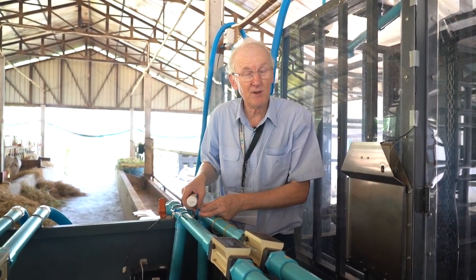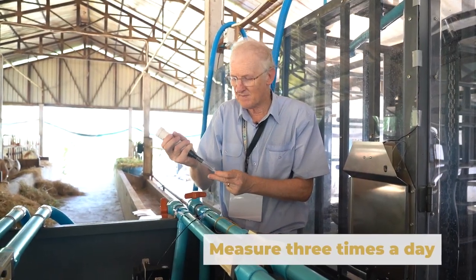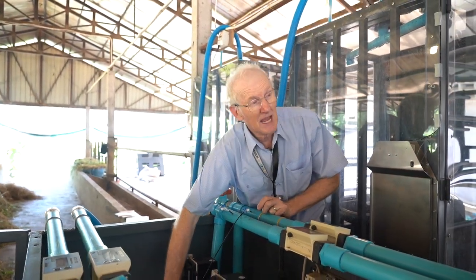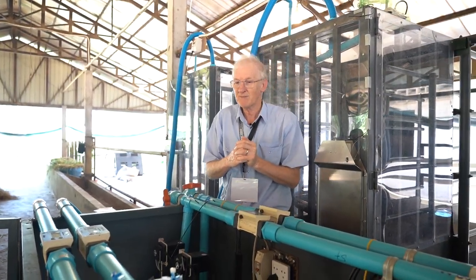And at this laboratory, they tend to measure that temperature and pressure 3 times a day, because obviously temperature goes up in the middle of the day, comes down again at night time. So if we want an average temperature and pressure for the day, we measure it a number of times and record it.